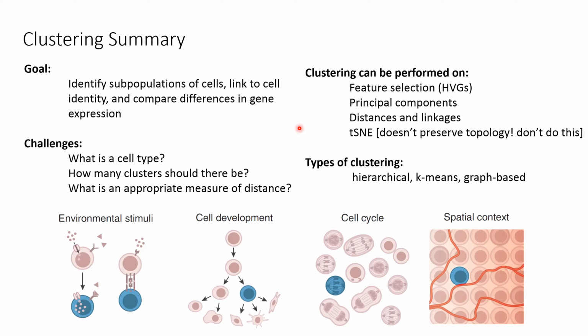But we also know that all dimensionality reduction tools induce distortion on the data structure. So we have to be careful when choosing how and which tools we apply.